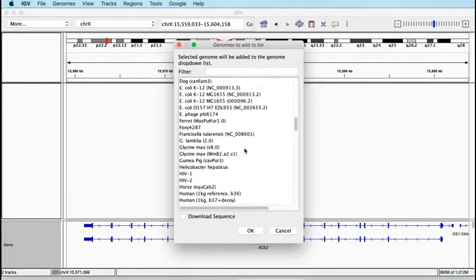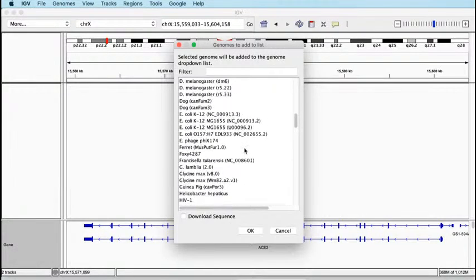We're obviously interested in E. coli in this case, because the E. coli K12 genome was the reference genome that we aligned to. And actually the reference genome that we aligned to, if you remember from our FASTA file that we downloaded from the NCBI, is NC_000913.3. So we can check that actually.